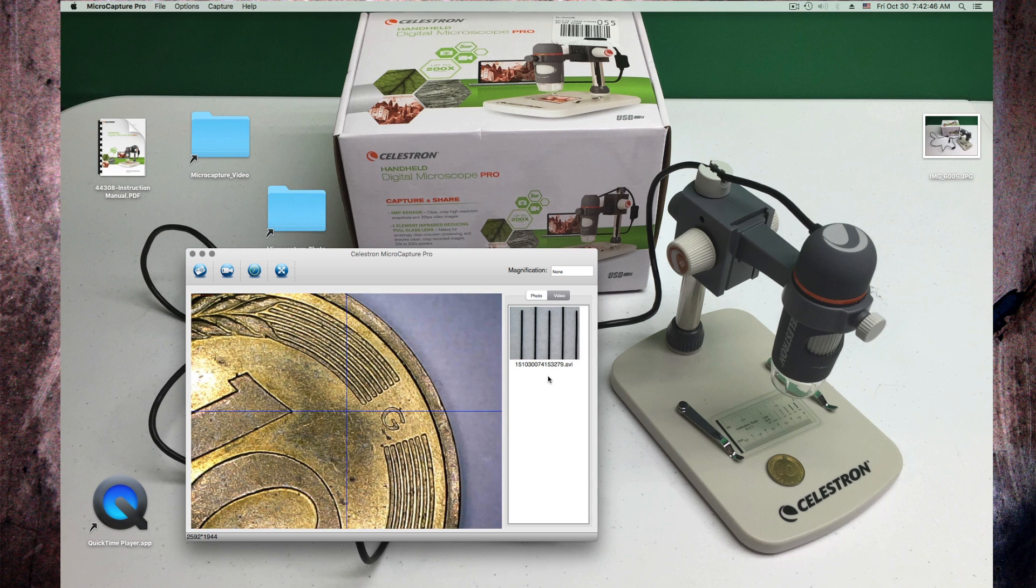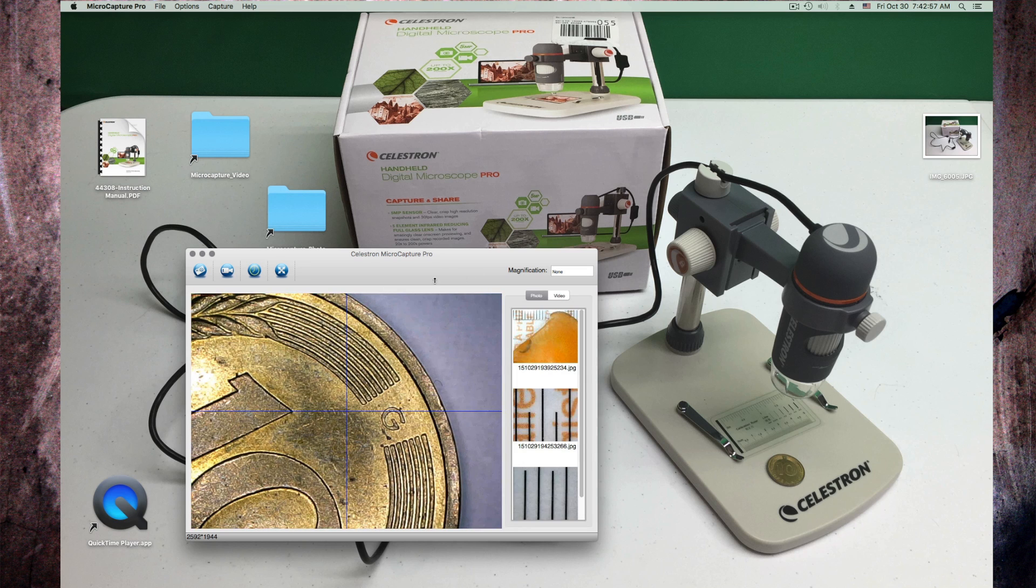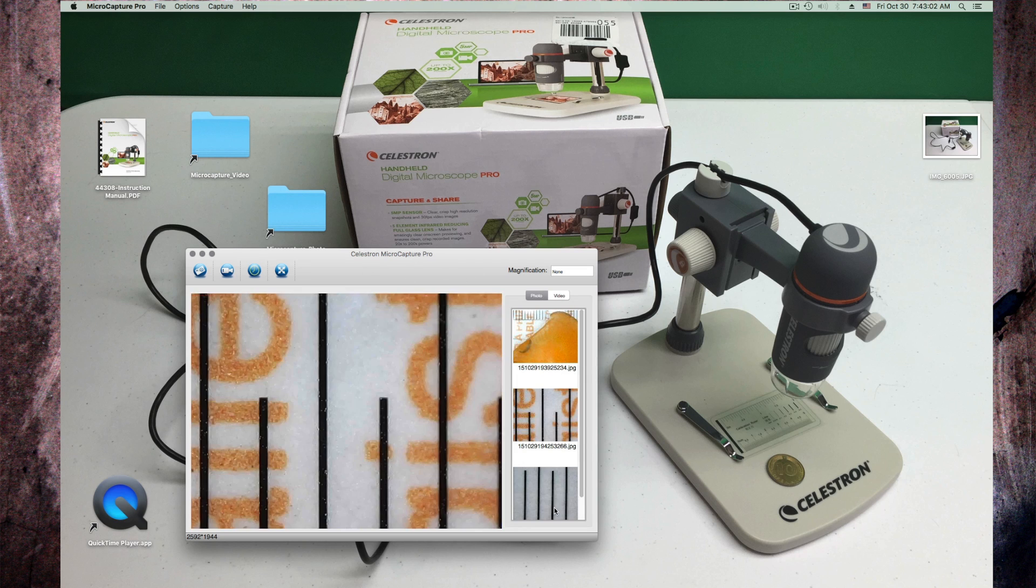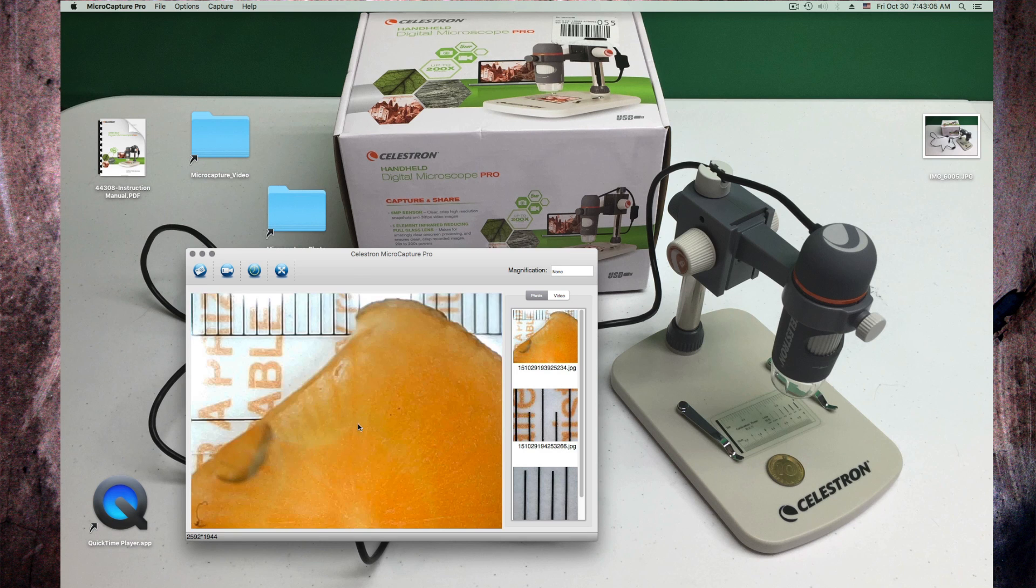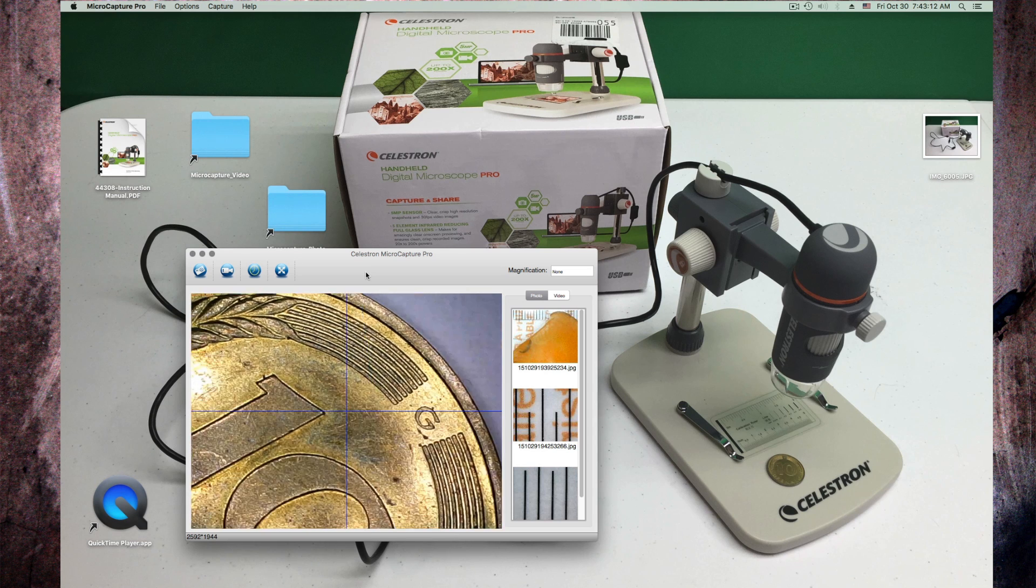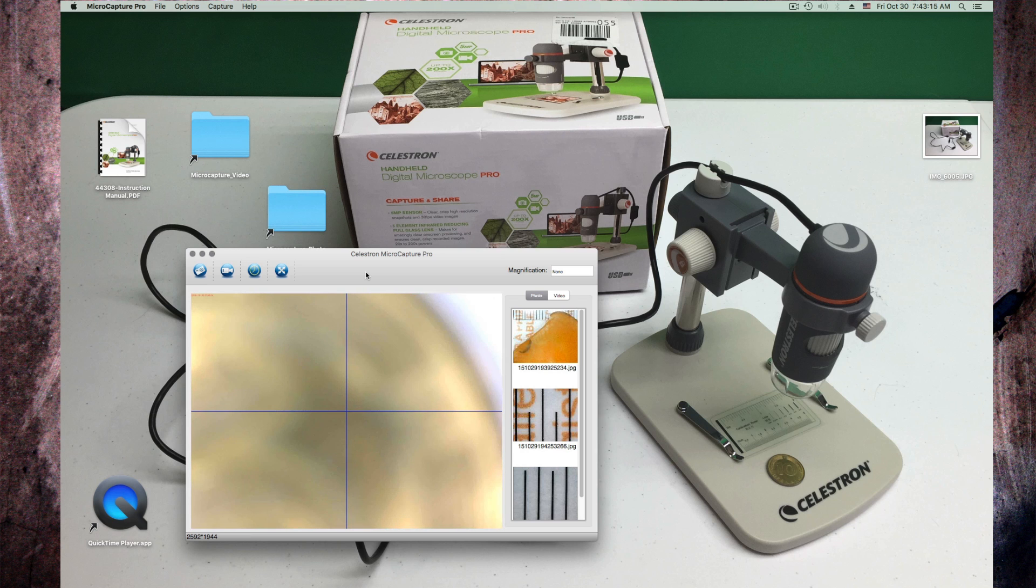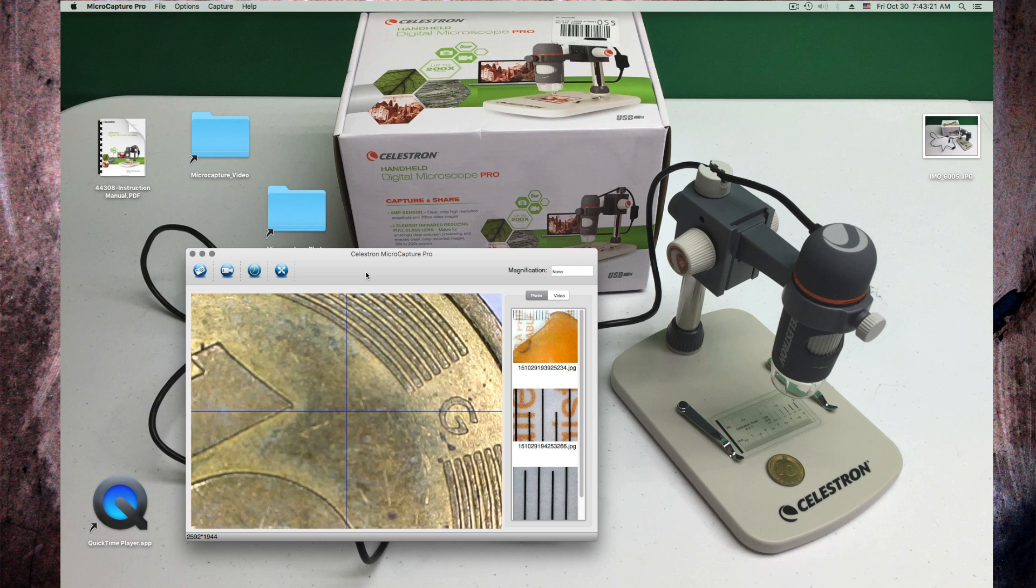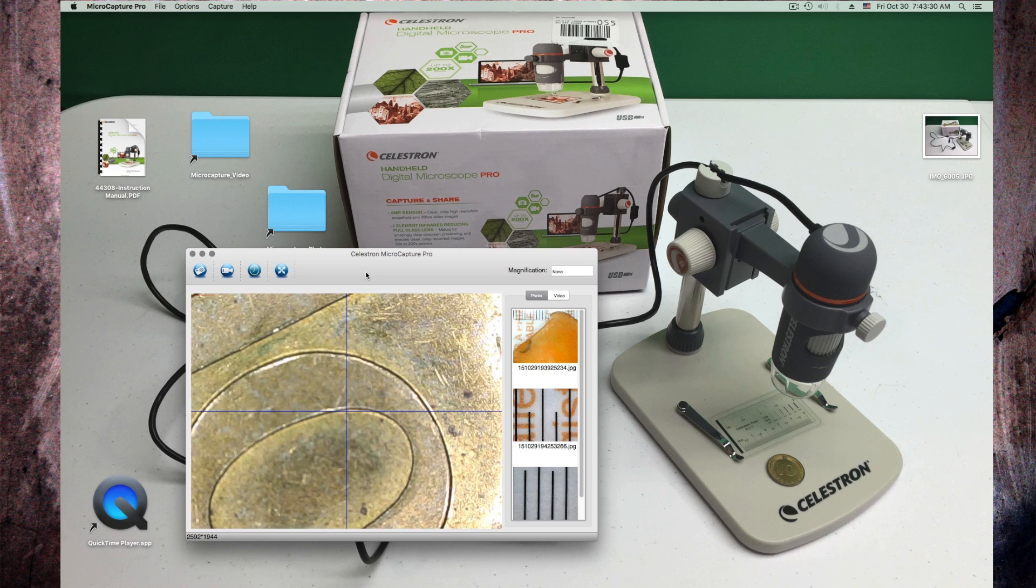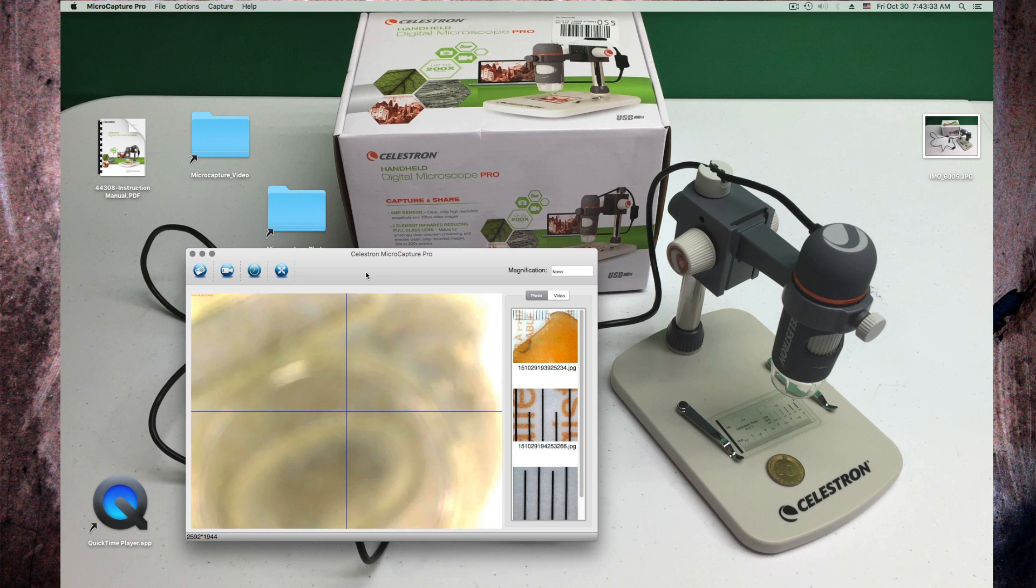So the video will show here on the right there, video, or should show here. Then see that it's lagging again. When you hover over the little tiny pictures, it shows the preview here on this side. So let's move in on the coin here. Focus here.